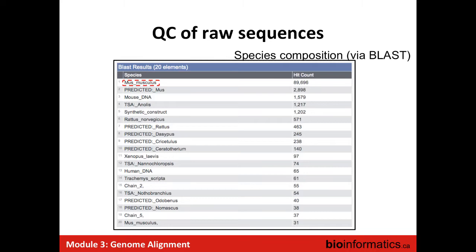What we also do, something that we only started about 5 years ago, is when we have a FASTQ, we randomly take 100,000 reads and we BLAST them against the nt database just to check what we have sequenced. Because sometimes you could have some surprises, as there could be some contamination or mixing. So if you are sequencing human and you see results with mouse, at first you say, oh, there's a problem.